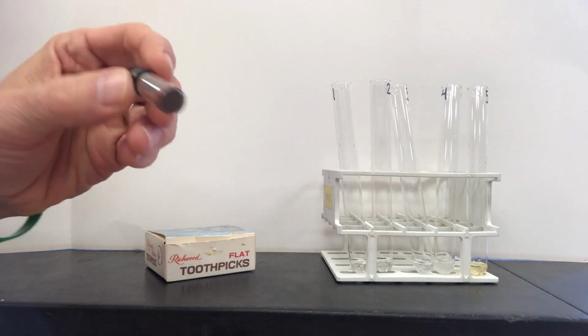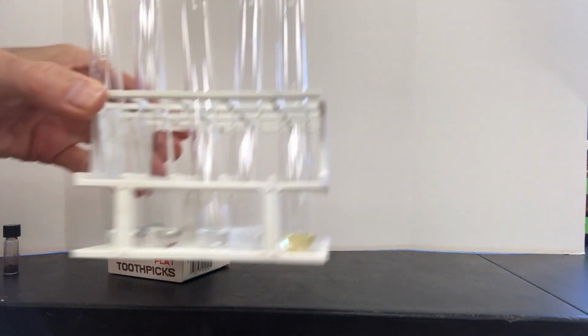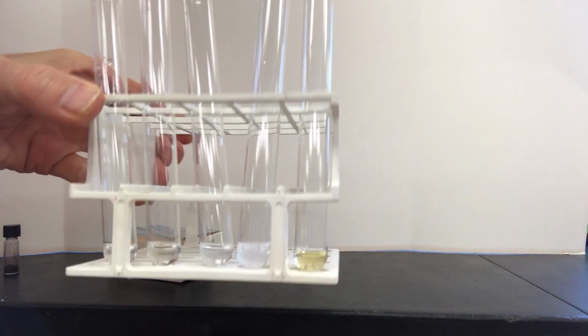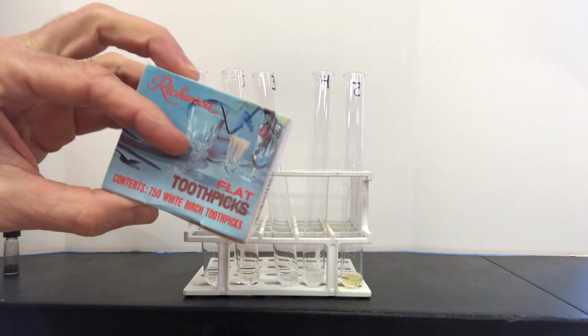The oil red O test indicates the presence of hydrophobic or nonpolar substances. The dark blackish-brown powder doesn't dissolve in water and merely floats on the surface. In the presence of a hydrophobic compound, the dye dissolves and the solution becomes bright red. This happens at room temperature and can sometimes require vigorous swirling to get complete dissolution of the dye if a nonpolar solvent is present.